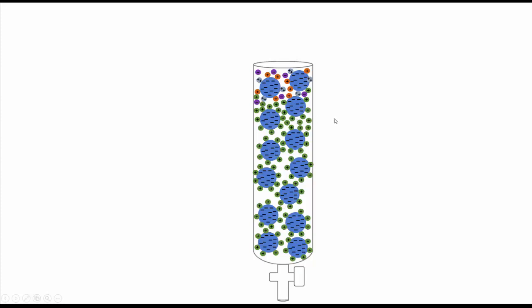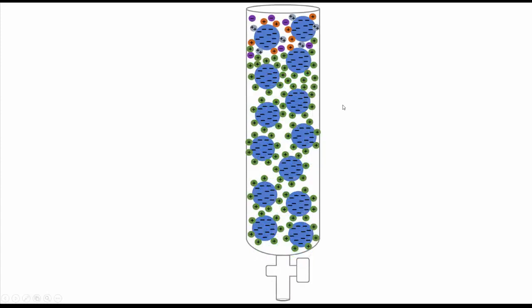So we also call this ion exchange chromatography because the idea is that the positive ions in our mixture are going to take the place of the ions that were already attached to the resin, and then as the mobile phase passes through, it's going to travel down at different rates depending on the charge, but also the density of the charge, so whether it's a 2+ or 3+ or 1+. So a 2+ will have a much greater affinity, which means attraction, to the negative charges compared to the 1+. And we'll see that as we go on.